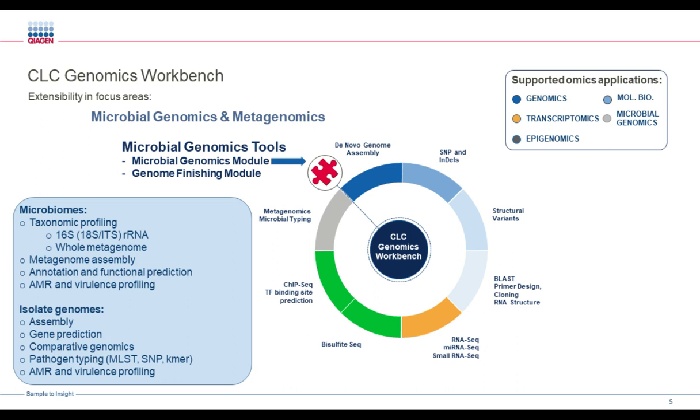And more importantly for this talk, you can use the CLC Genomics Workbench and associated microbial genomics module for a broad range of different applications in the microbial genomics space, including taxonomic profiling, metagenomic assembly, annotation and functional prediction of genes from metagenomics datasets, antimicrobial resistance and virulence factor detection and characterization.